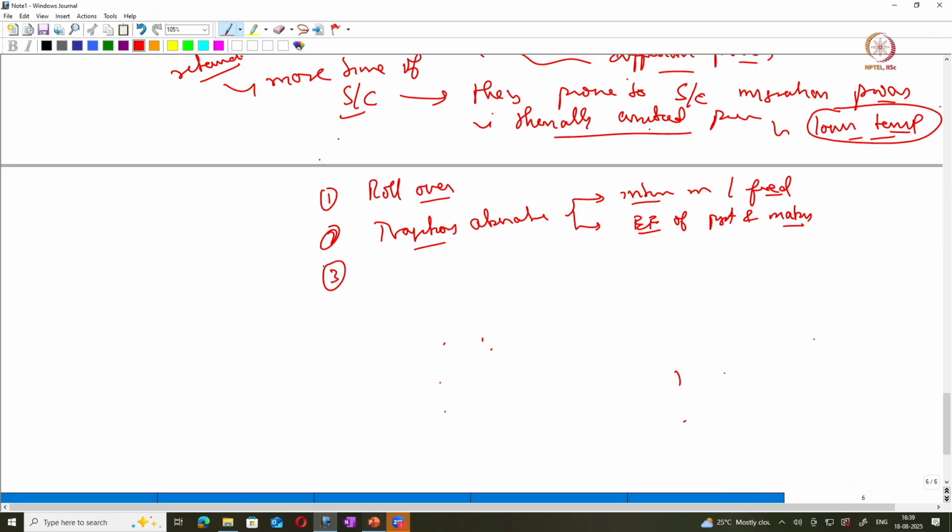The third one we discussed is that if there is a difference in the evaporation field of atoms or species from the matrix, it might create a retention of that atomic species, or an early departure of those species.